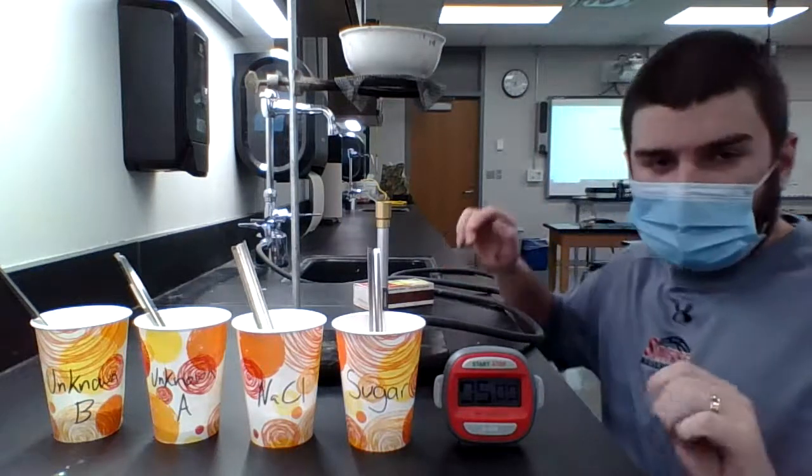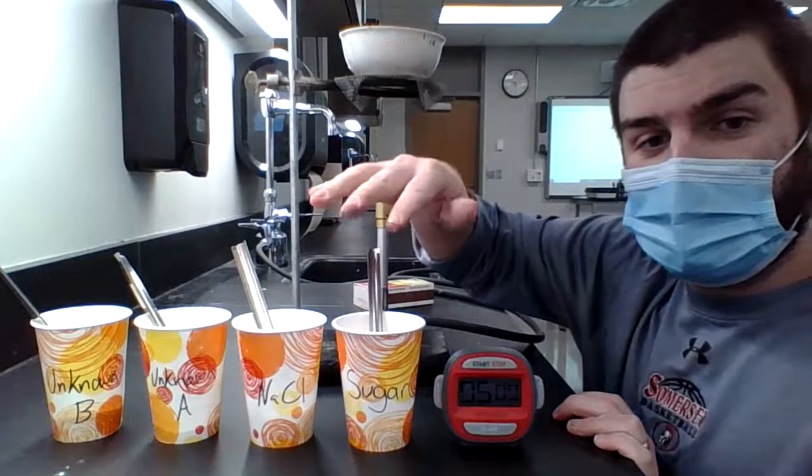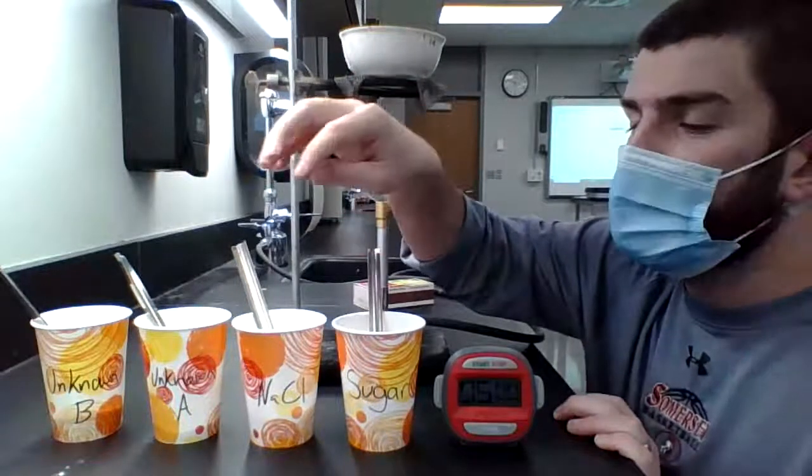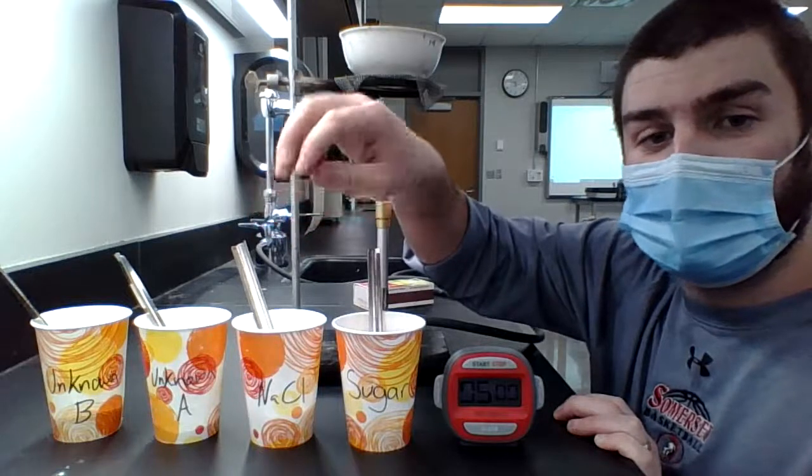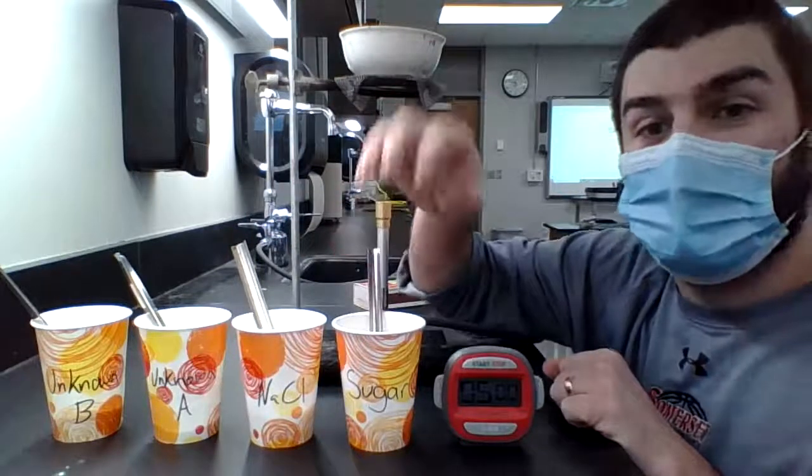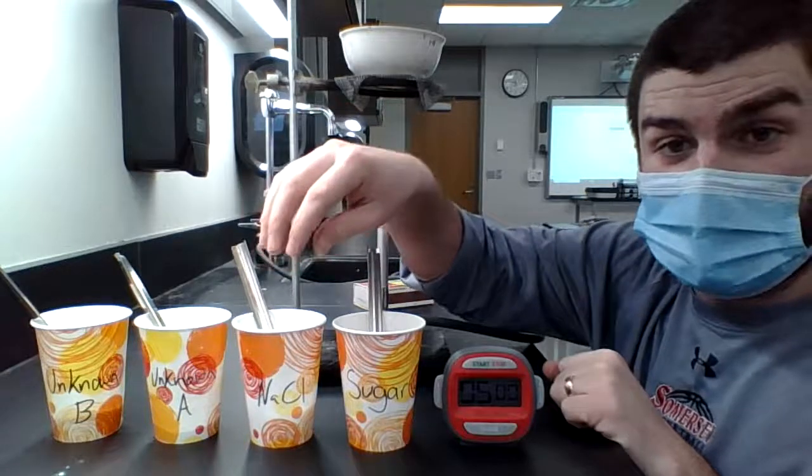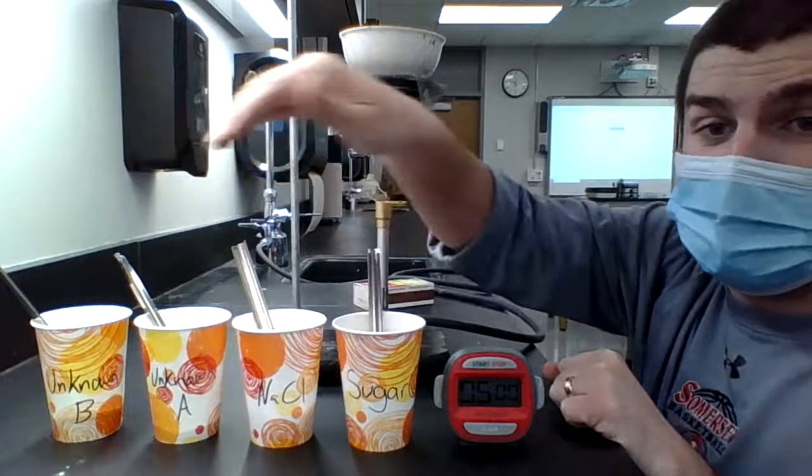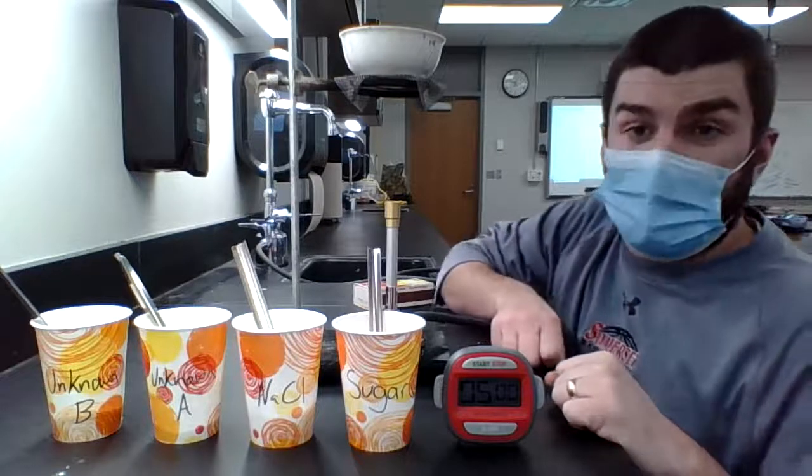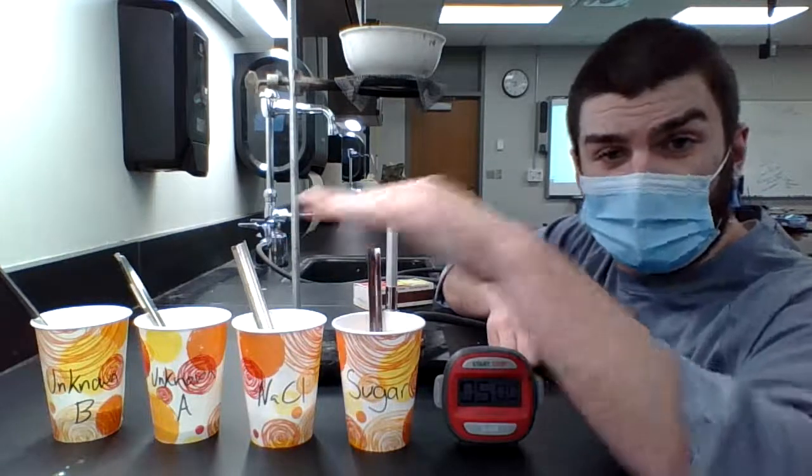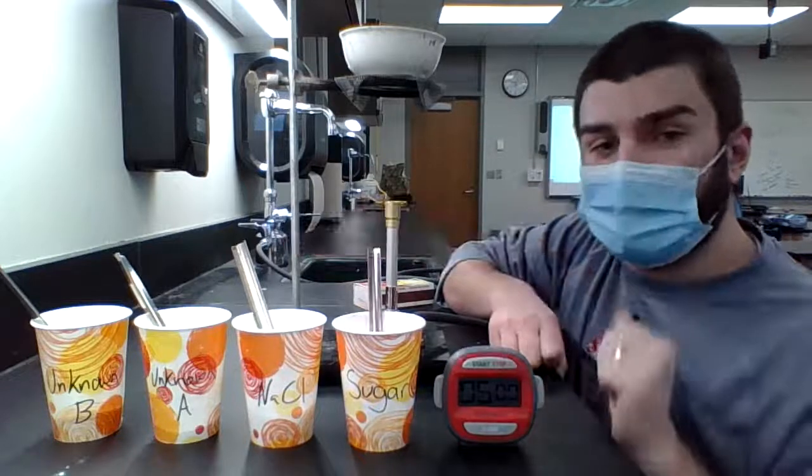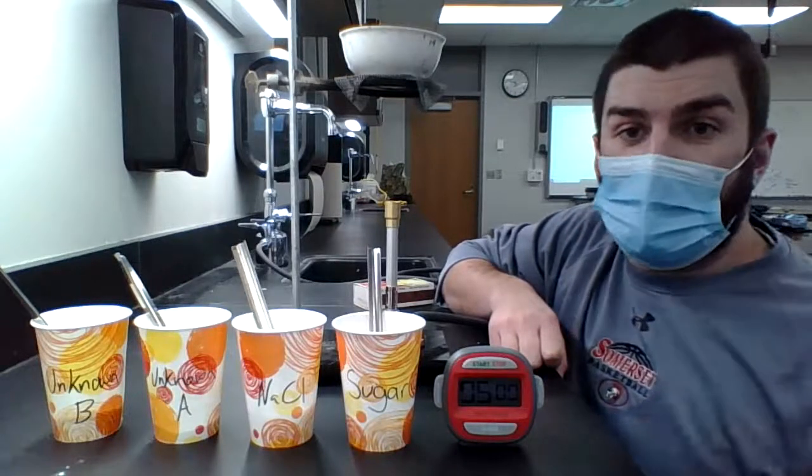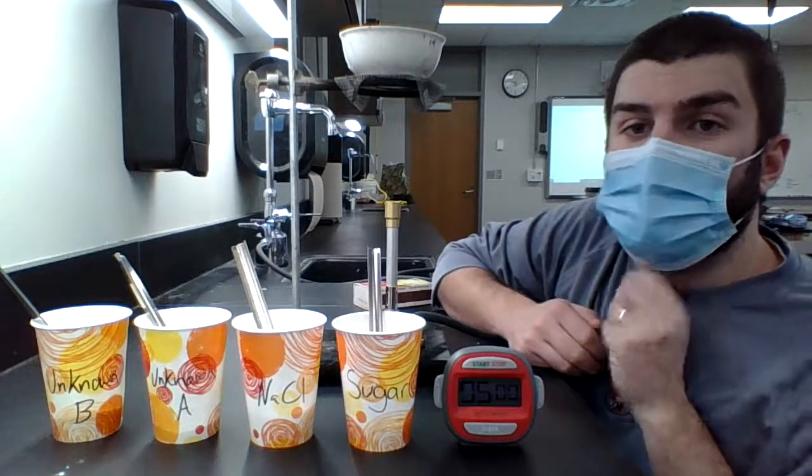So for this lab, you're going to need a timer. You need four substances. In this case, we have sugar, which is a covalent bond compound. You have NaCl, which is table salt, which is ionic, meaning it's a compound. And then we have an unknown A and an unknown B. We need to figure out what the strengths are, which one is stronger. So we need to first test sugar and salt, and then we will compare the results from these two to our unknowns to determine what type of bonds the unknowns have, whether they're covalent or whether they are ionic.